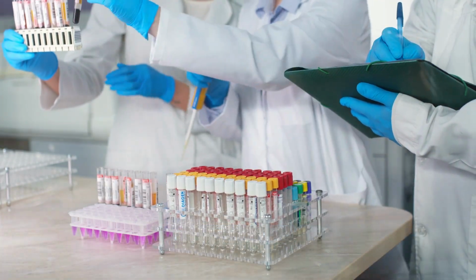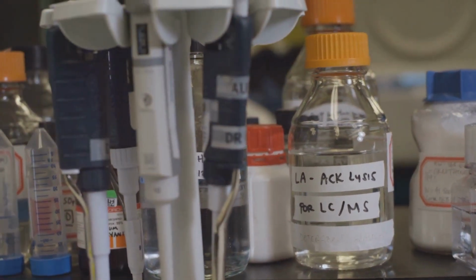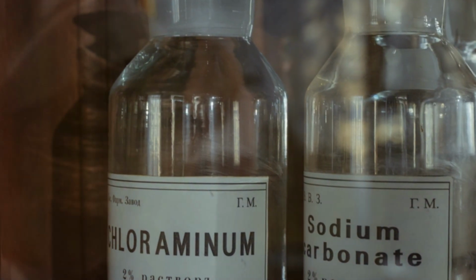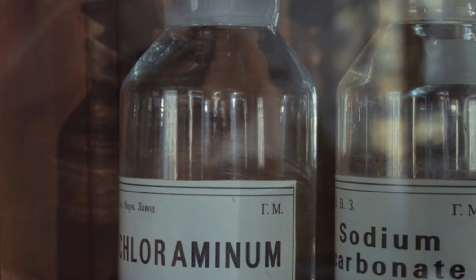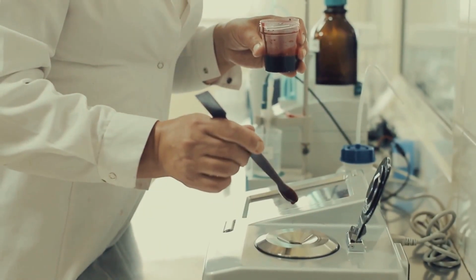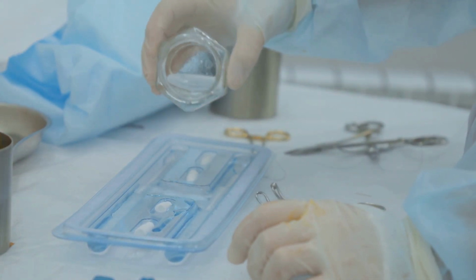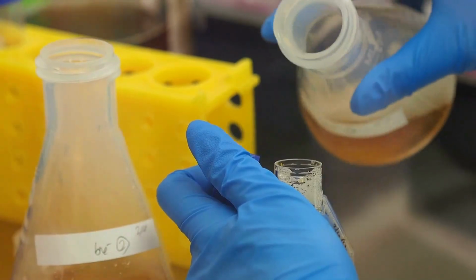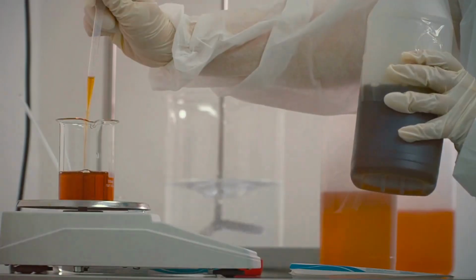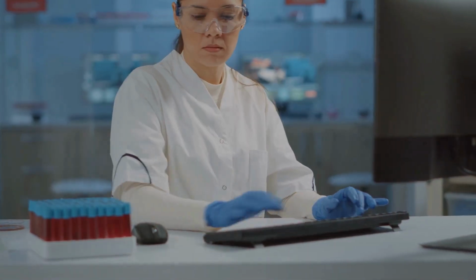Your buffer is your protein's new home. Get it right. Use a stable pH, 7.0 to 8.5, with Tris-HCl or HEPES, 20 to 50 millimolar. Add 150 to 300 millimolar NaCl to mimic physiological conditions. Avoid phosphate if working with metal ions. Always add protease inhibitors to protect your protein. Include a reducing agent like TCEP or DTT, 1 to 5 millimolar, for stability. Glycerol, 10 to 20%, helps keep proteins folded. Some proteins need native lipids or cholesterol analogs, add if needed. Test a few buffer variations to find what works best. A well-designed buffer can make all the difference.